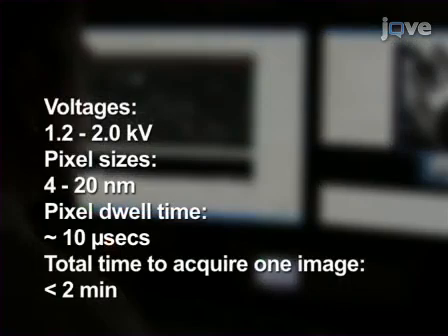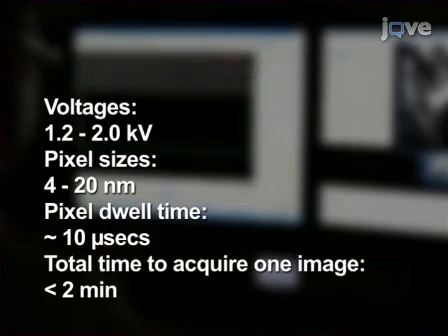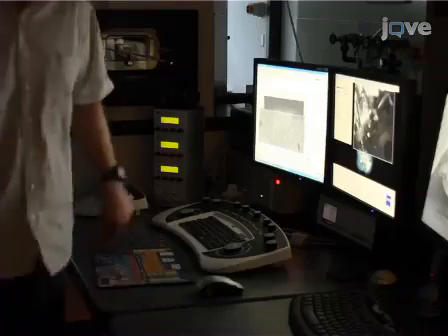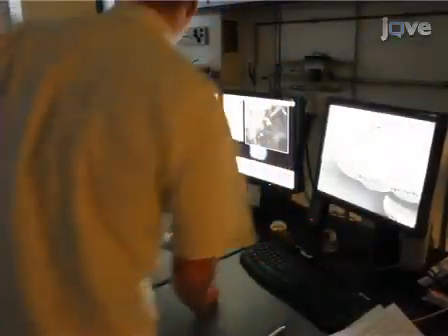Typical parameters are voltages between 1.2 to 2 kilovolts with pixel sizes between 4 to 20 nanometers. The pixel dwell time should be around 10 microseconds so that the total time to mill the face and acquire one image is below 2 minutes. Let the microscope rest for at least 2 hours for any thermal changes to dissipate. Start the milling and imaging process to acquire serial images through the region of interest.